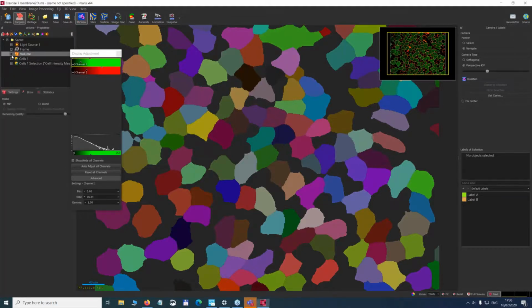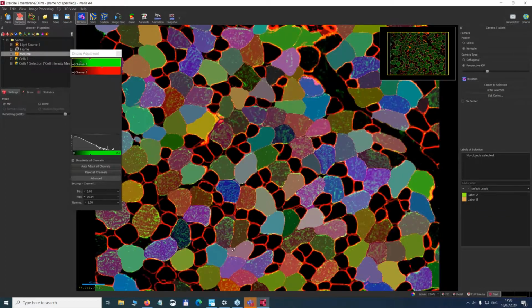We also have Carol asking, could the cell module be used for tracking flashes of calcium signal in a cluster of cells? We've had a similar question come up when we were talking about tracking, so you might want to go back to that and watch a little bit about it. In this case, I'm guessing you mean, Carol, that you have a membrane label.